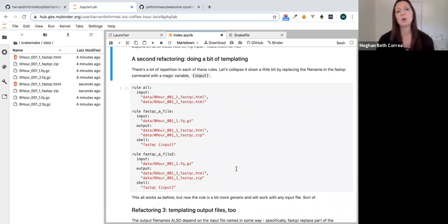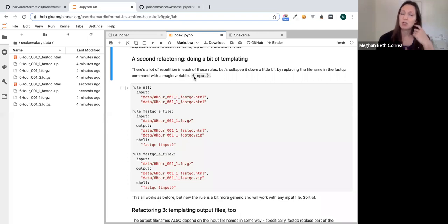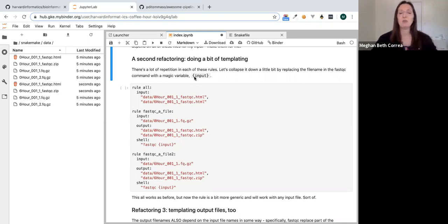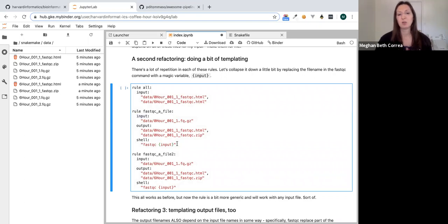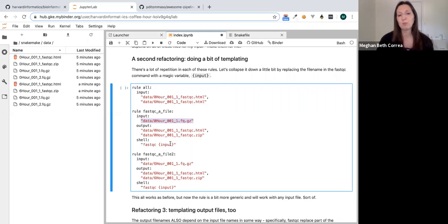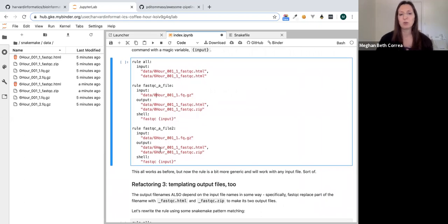Let's do some refactoring, because our two rules are pretty similar — we're basically just running FastQC on different files. The first way to make rules more generic is to use Snakemake's magic variables. Any magic variable or wildcard appears in curly braces and gets replaced by the value Snakemake knows about. For example, {input} represents the rule's input, so if we say 'fastqc {input}' as the shell command, it replaces that with the input file name.